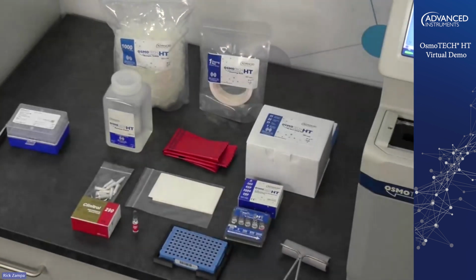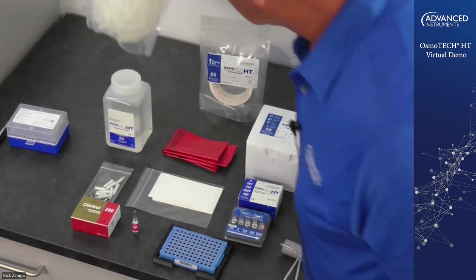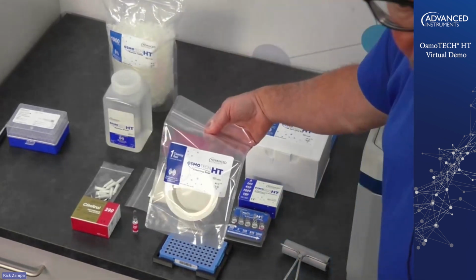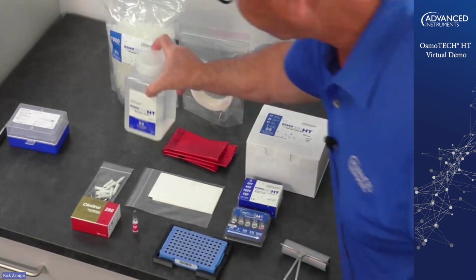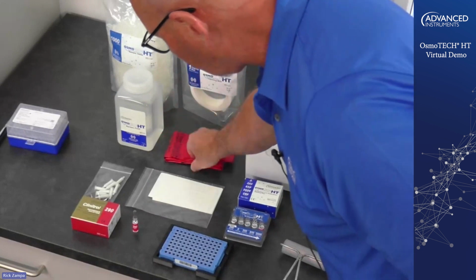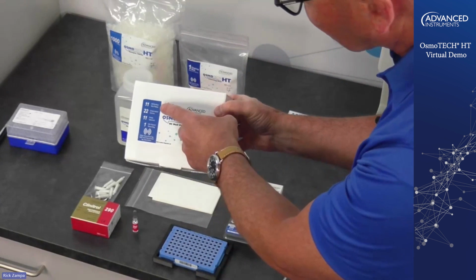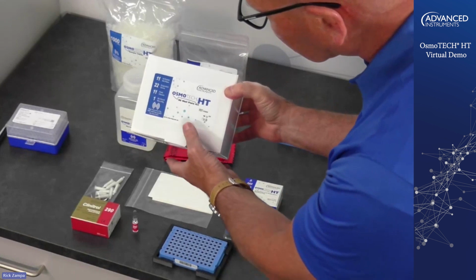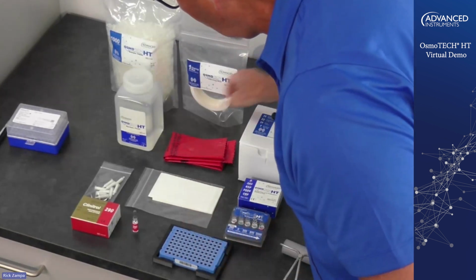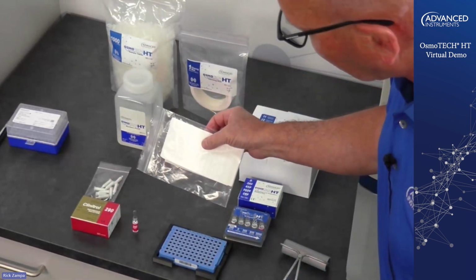Now I want to quickly turn over to this side and talk a little bit about the consumables that go with the instrument. So we have our bag of 1,000 sample cups here. We have our wiper ring, which goes in to clean the sample probe between each test. We have our system cleaning fluid, our hazardous waste bag, which goes in the disposal bin. We have our box here, this is our test kit. So you have 11 96 well plates in here, 22 evaporation covers, 11 probe cleaners, and then one hazardous waste bag. So these are your evaporation covers, which will go on top of the 96 well plate.